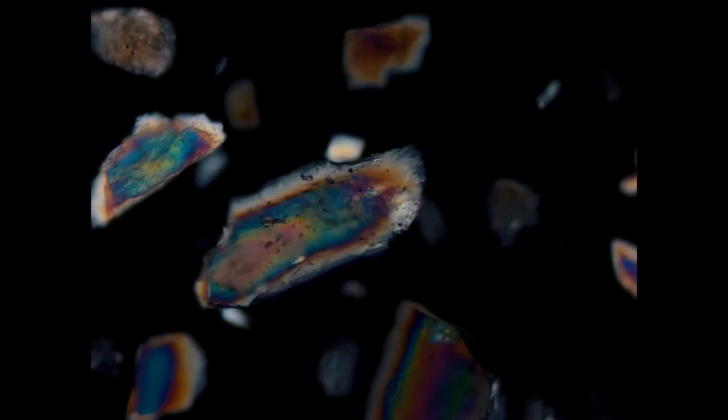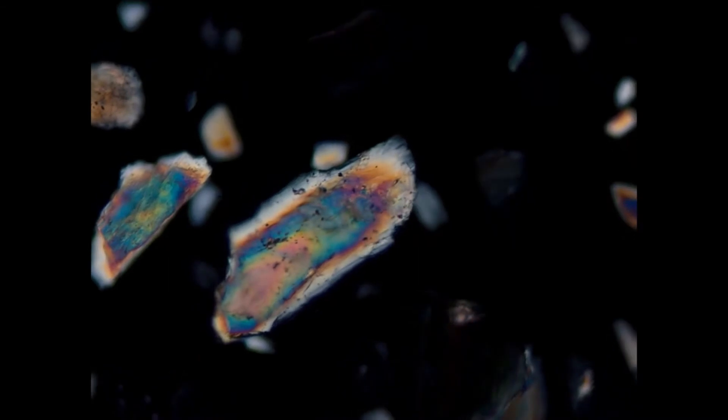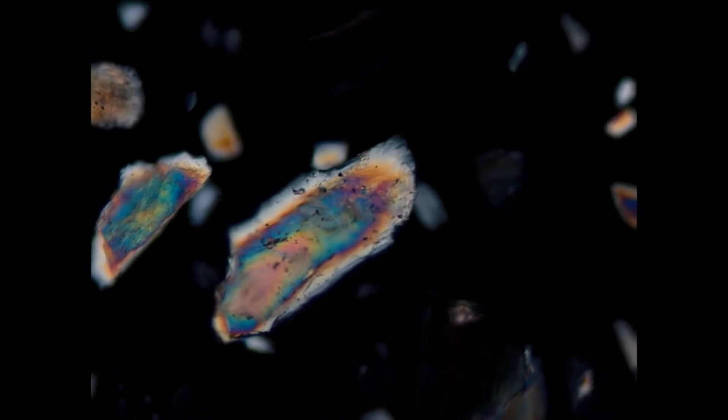If we look at the grain under cross-polarized light, we can see interference colors of the first and second order, depending on the thickness.